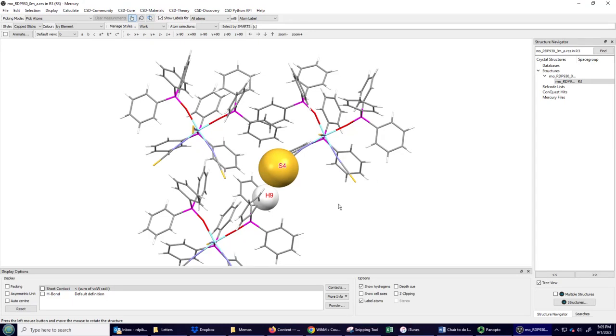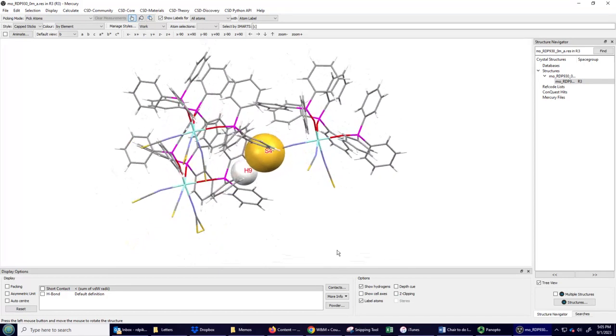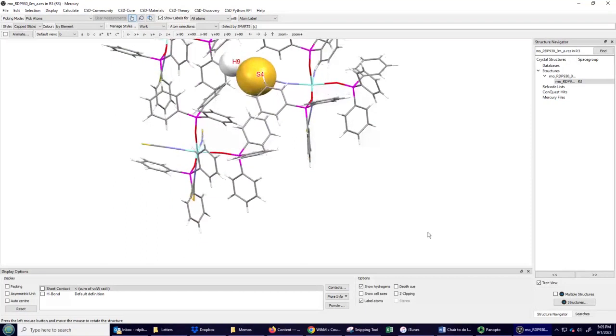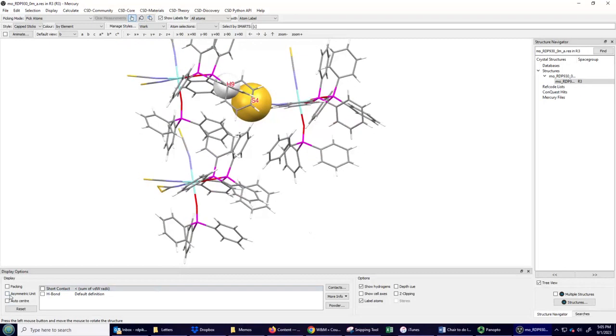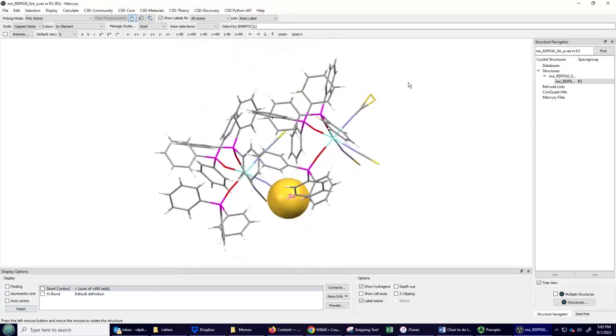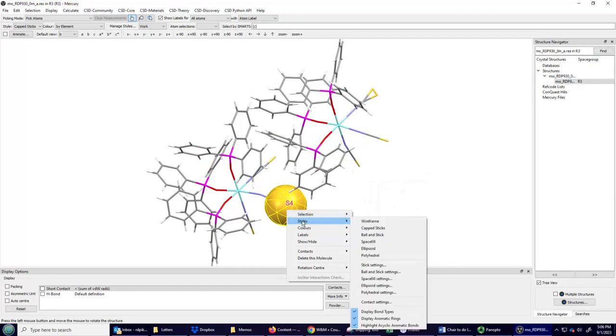All right. So that's some of what we can get out of X-ray. And really, there's a good deal more. But you can see that just the very fact that you can see a molecule in what is essentially a 3-dimensionally rotatable photograph is a really powerful tool. We know that these molecules are real entities.